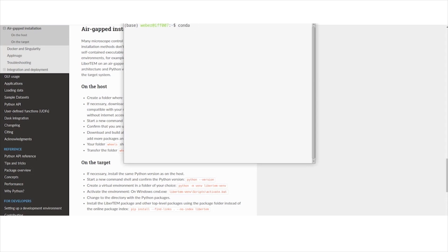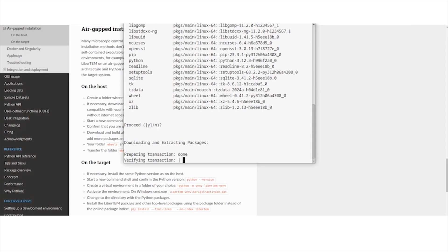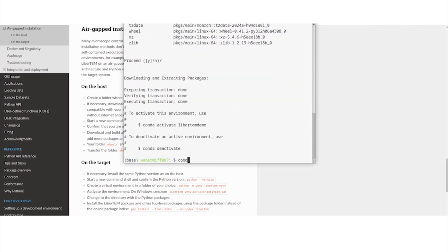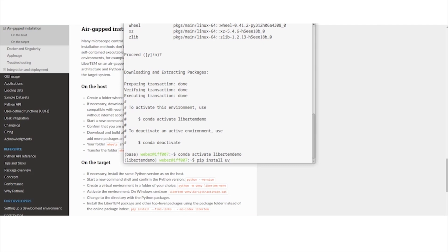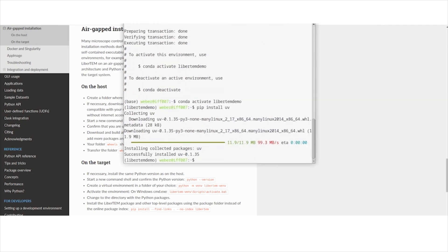Let's start by creating a conda environment. I've already got Miniconda set up — you can see the prompt showing which environment we're in. Let's call it 'libertem-demo' and use the most recent Python we support, Python 3.12. We try to keep current with Python versions, though we sometimes lag a bit behind because all our dependencies need to support the same version. Now I'll install UV, a fast pip replacement written in Rust. On a fast system like Linux it does non-I/O-dependent steps a lot faster.